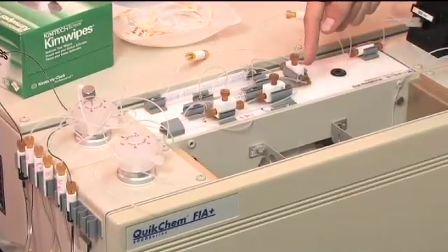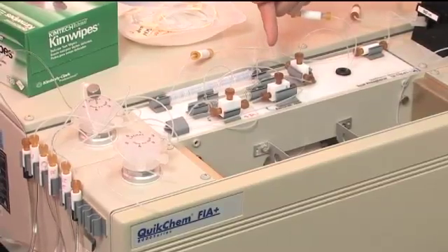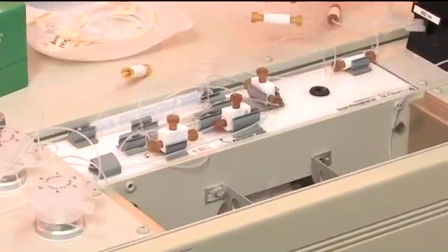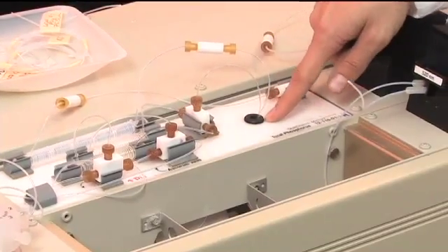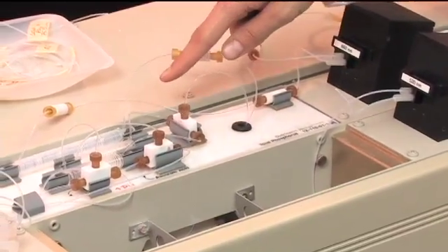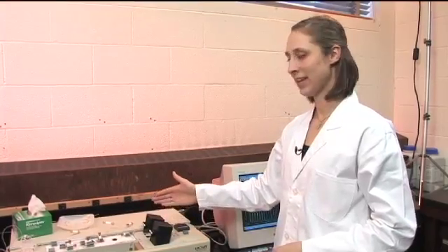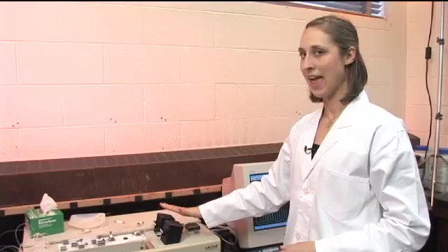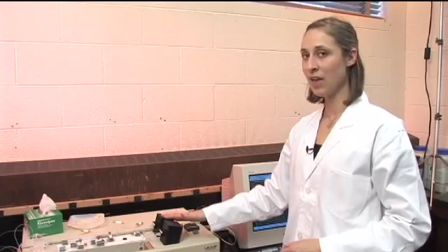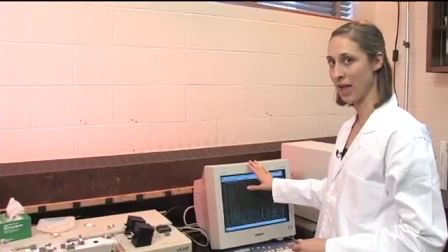Then the sample mixes with the ascorbic acid and the color reagent. You can see the green slowly moving as it goes into the heater to help develop the color. When it comes out of the heater, it mixes a bit more. As the samples come through, they get to the spectrophotometer, which is the detector, and it detects the change in absorption from that color that's coming through. That change will show up on our computer screen in the chromatogram as a peak.